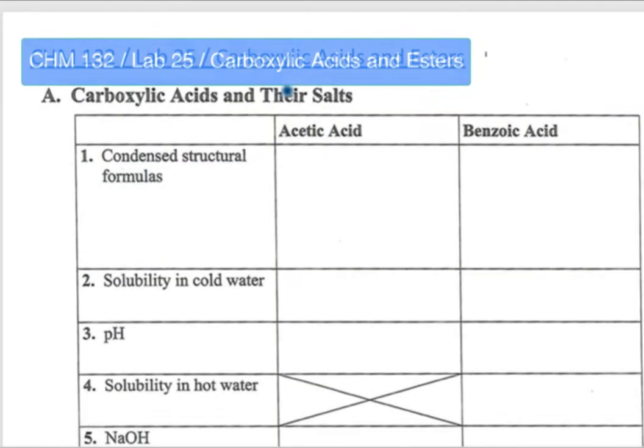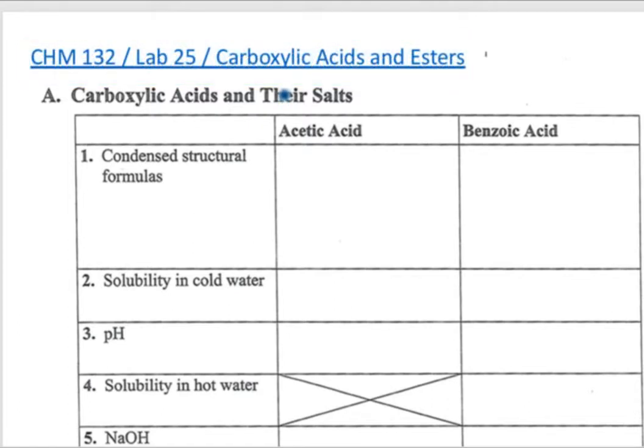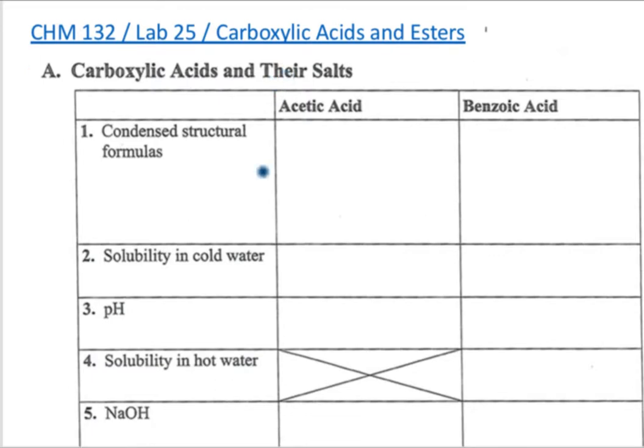In this video, I want to go through an introduction for Lab 25. I'll show some reactions, we'll show some experiments, and I'll show you the different sections that we'll do for this lab.